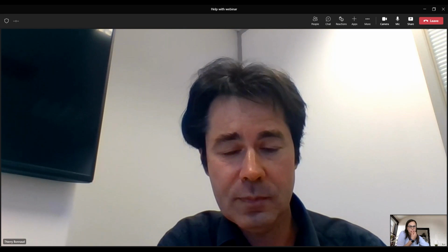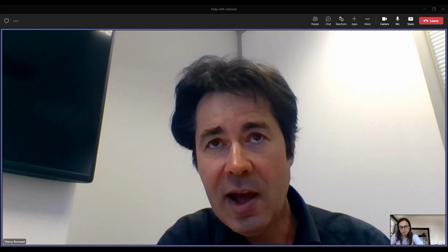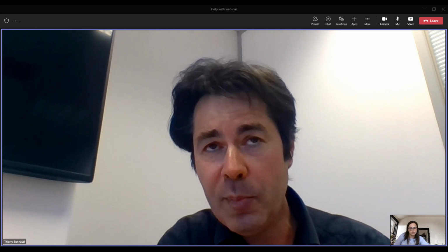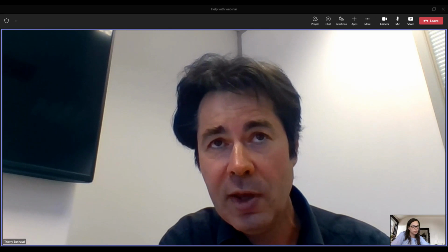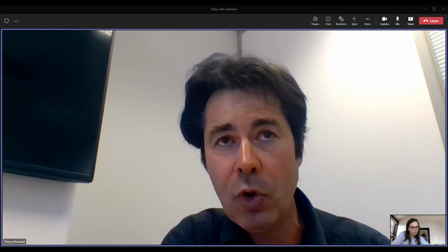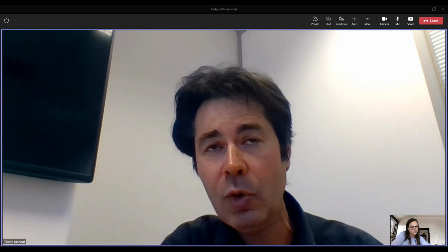Okay, thank you. Do you use dry seeding or wet seeding? I think it really depends on the scale. For small scale experiments, we start with what we have, which are dry seeds. As we move up in scale, let's say we are going to do a kilolab campaign, that's something we want to investigate. A wet slurry is easier to apply to your reactor, otherwise you may have the seed stuck in your line. Having a wet slurry prepared beforehand will be easier on a large scale. On a small scale, we will just take a tip of a spatula to look at the influence of the seeds. So really it depends on the scale.